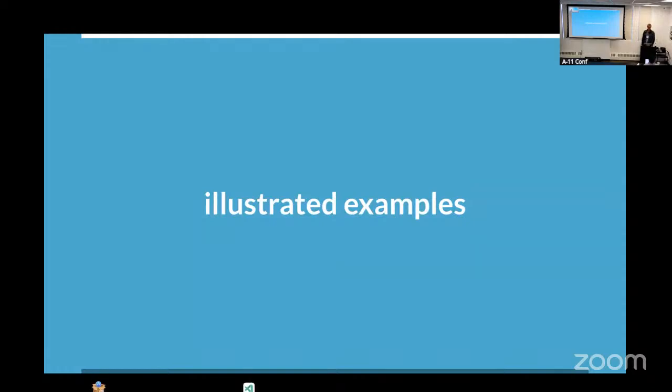Glad that's worked out. I'm going to take a quick step back and talk about this thing that I mentioned at the beginning, which is we've talked about the whole workflow and how things fit together within Warp and M specifically. I'm going to give an example of where going beyond that made sense and provided some value, so that you think to do this kind of thing for your own project if it's necessary. That could be at the picking stage, that could be within the refinements, whatever it might look like.